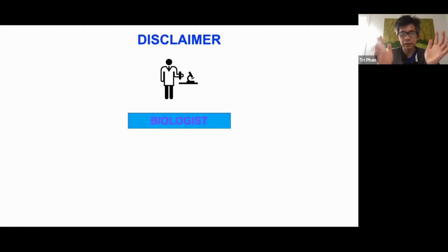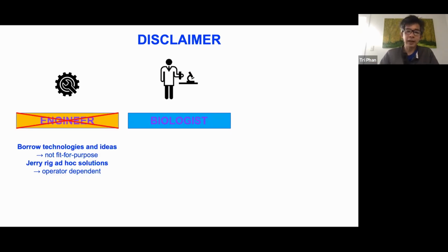Before I start, just as a disclaimer, as Steve mentioned, I'm really a biologist. I'm not an engineer, and that means that to do the sort of things that we want to do, which is to understand biology, particularly as it might relate to human diseases, we've had to borrow technologies and ideas from other people. In this context, we borrowed mostly from neuroscience the use of intravital two-photon microscopy to try to track the behavior of cells in living animals, particularly immune cells that migrate and cross anatomical boundaries quite often in the course of their lifespan.